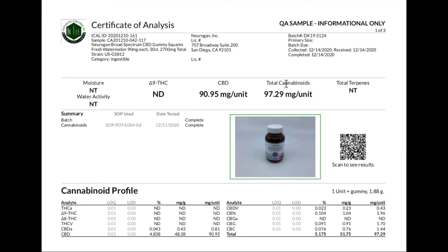However, we strive to hit the number exactly to give you a touch more milligrams than marketed. Move right to the next column, total cannabinoids. This is always an important section on a THC-free broad spectrum product or full spectrum product. Nuragin uses premium hemp and its products will always contain more cannabinoids than just CBD. So expect that this section will show a higher milligram content than the CBD section because it's accounting for all the extra beneficial cannabinoids that the product contains. Now onto the cannabinoid profile, where we actually get to view a broken down detailed analysis of each cannabinoid in the product.